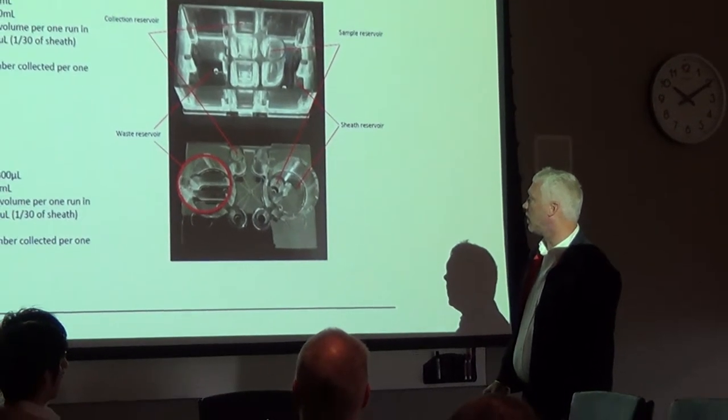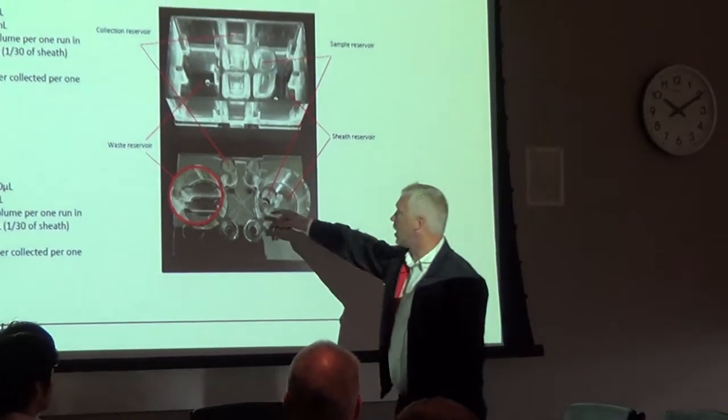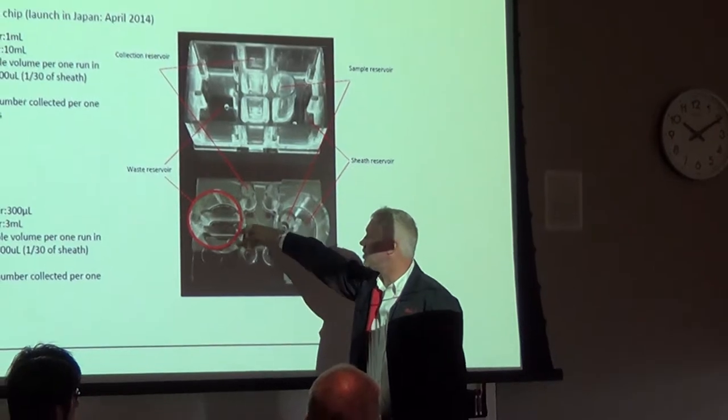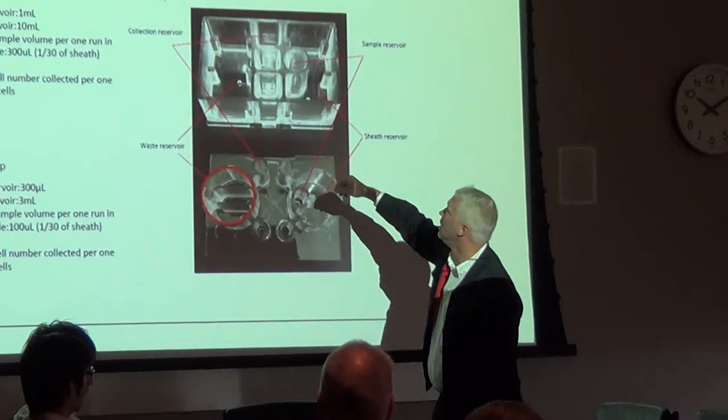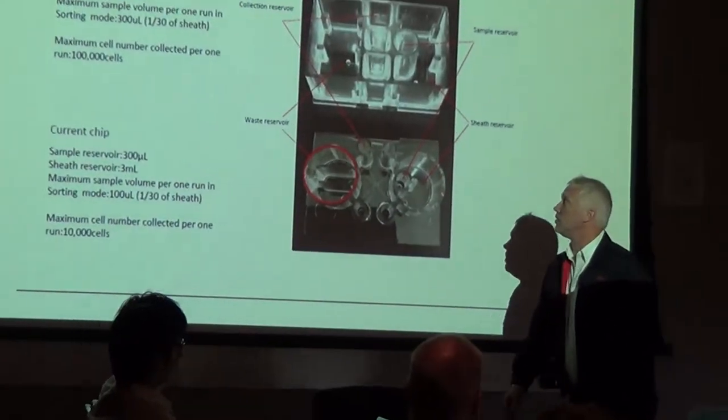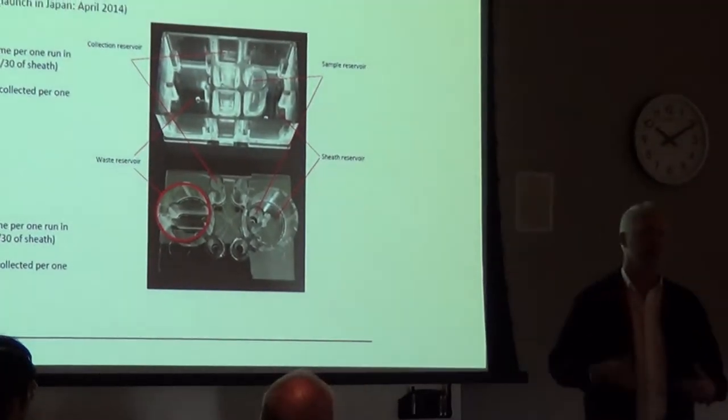And when cells are identified, they're popped over here into the collection reservoir, and this is for waste. And you'll see that on the bigger chip, we've just tripled the space that we can use for each run.